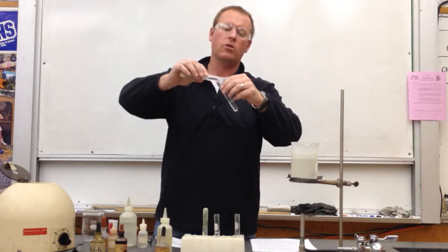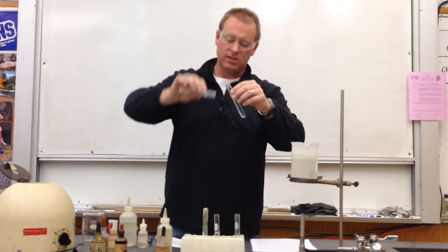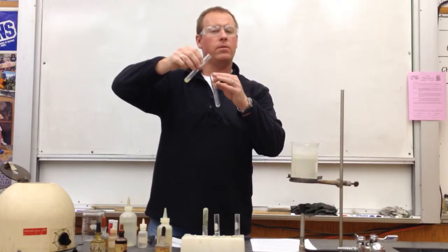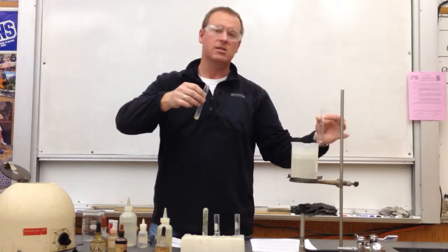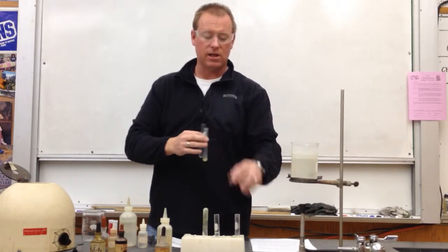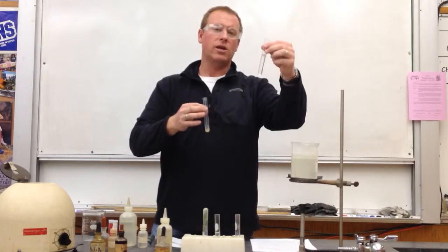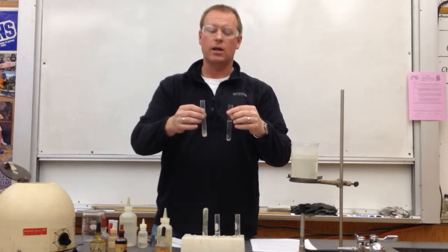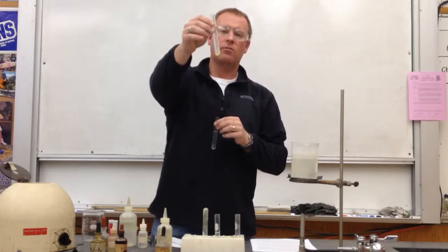The reason for doing that, rather than pouring it directly into the sink, since this precipitate is not as dense, if I were to accidentally pour too quickly, there's a high probability that my precipitate might pour out with the solution and end up down the sink, and I'd have to start over again or go back to my test tube that I'd saved all the way back in procedure step 5. So if I poured it into another test tube, I could always pour it back in, recentrifuge, and try again. But I was successful here. I poured off the liquid, and I was able to save my precipitate.